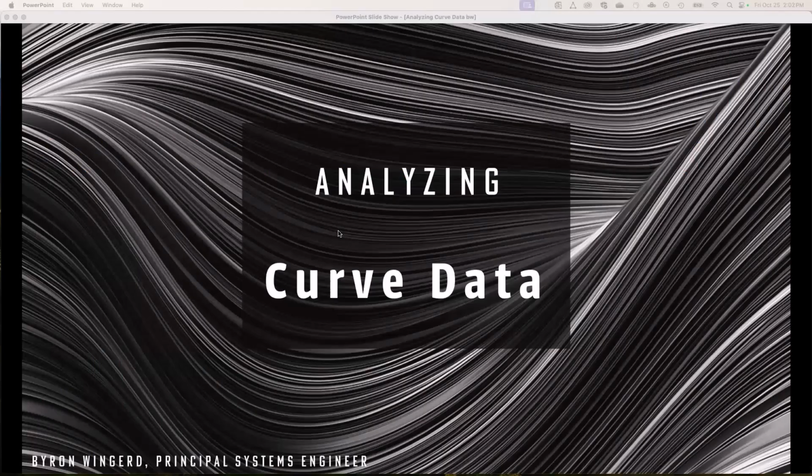So this afternoon, what I'm going to talk about is analyzing curve data in concept and then some examples. Most recently, the thing I'm on is looking at data for ICH Q14, which is kind of like QbD or Six Sigma for assay development. There are some new guidance documents out that talk about some complicated ideas.